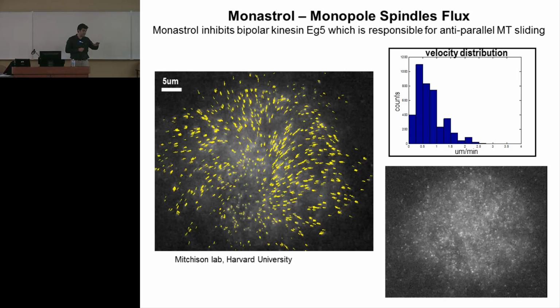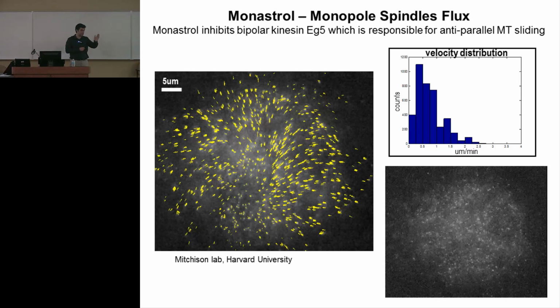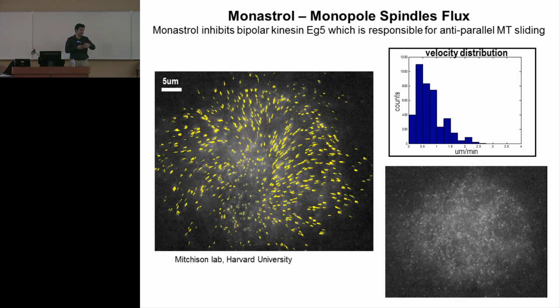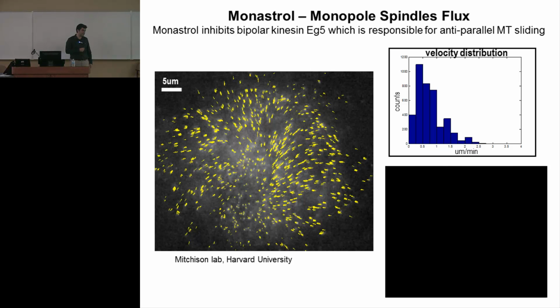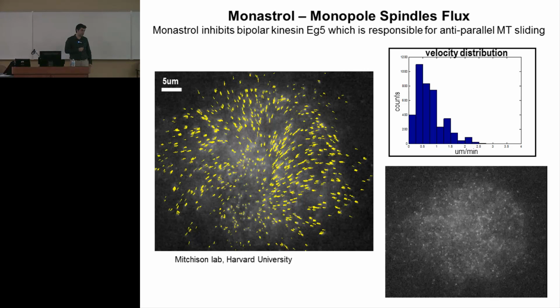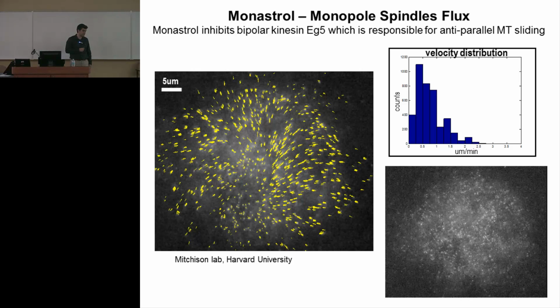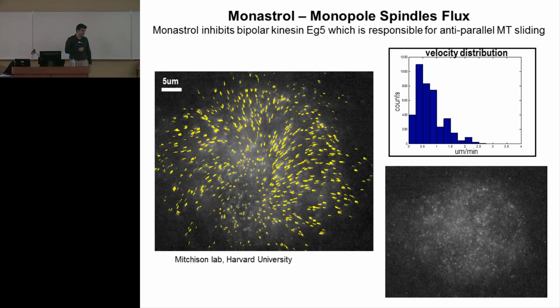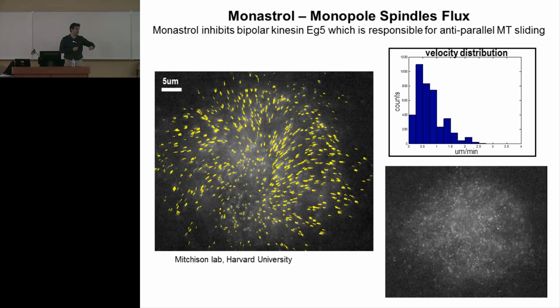By expectation maximization, you find the directions and the number of classes, let's say 3. And they go 0 degrees and 90 degrees. Let's say 2, just to make it simple, 0 and 100. And then I do k-means to assign. Right, but the points you're clustering have the direction information. So you're saying, cluster into 2 directions. Where do you get the direction? From the expectation maximization, for example. Then after the clustering, oh, so it's an iterative process. So initially you don't have direction, but then you... No, I make 3 or 4 loops.